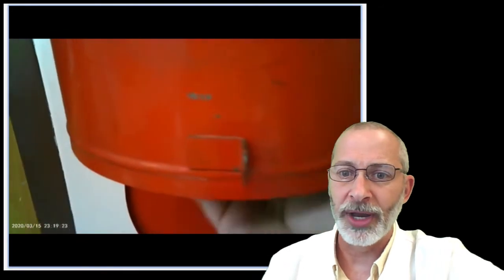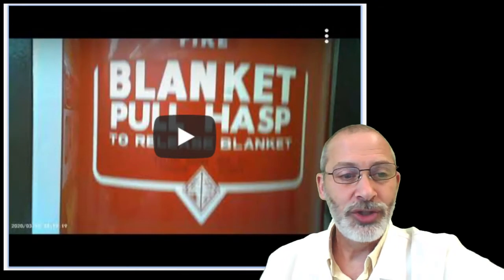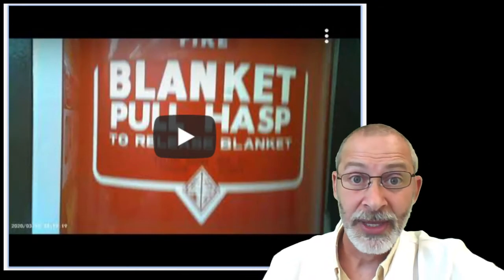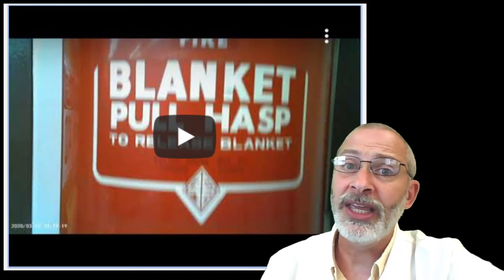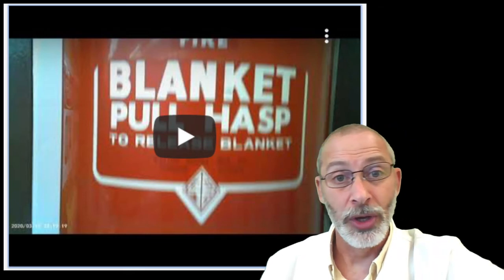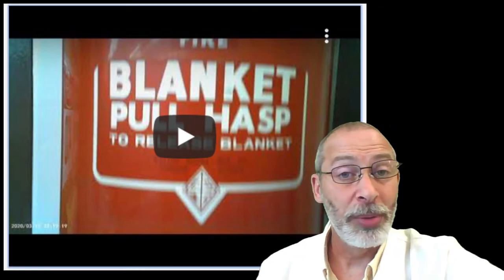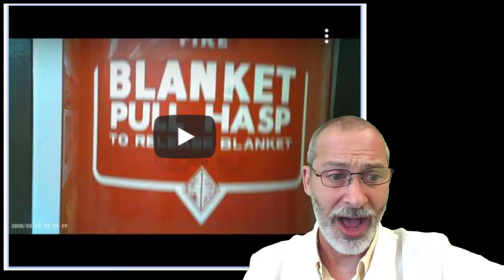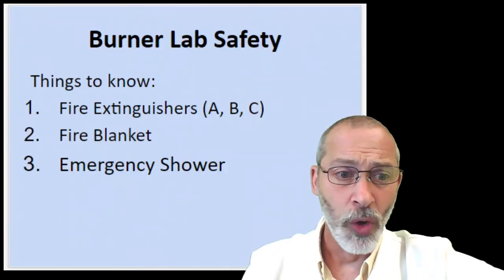You simply open it up, and the fire blanket comes out the bottom. You open it up and throw it on someone after you've opened it up to help extinguish the flames that they might be engulfed in. And remember those words you learned in kindergarten: stop, drop, and roll. So if you're near the fire blanket, you grab that fire blanket and you toss it around someone if they're on fire and encourage them to stop, drop, and roll.